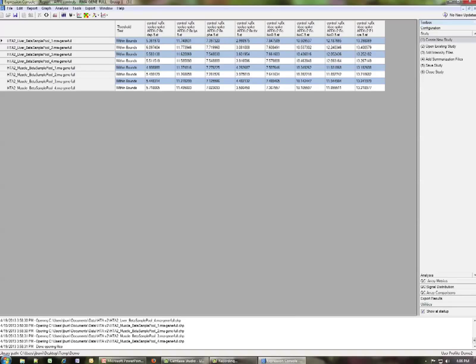So that's how one goes about editing the control metrics. You can either add a threshold or you can modify the thresholds that are existing.